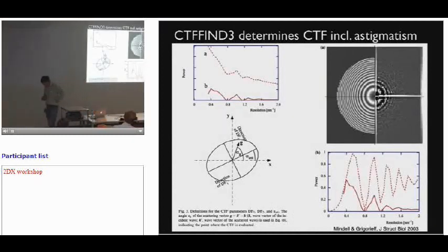Of course, if we speak about this, then there is another complication. I showed you quickly about astigmatism. Astigmatism can be pretty well taken care of during the data collection. Nevertheless, you sometimes still introduce slight astigmatism. And this is an example of a program, CTFFIND, that deals with this. And here you just need to define this kind of shape in a way, and the way CTFFIND defines it is by having a defocus 1 and defocus 2 in perpendicular directions to each other, and then this kind of angle that describes the position of the ellipse, and then this can be used to simulate that particular CTF. Other programs have different types of definition, so one should be careful in treating them. They cannot be interconverted straightforwardly, or you have to figure this out usually by yourself.